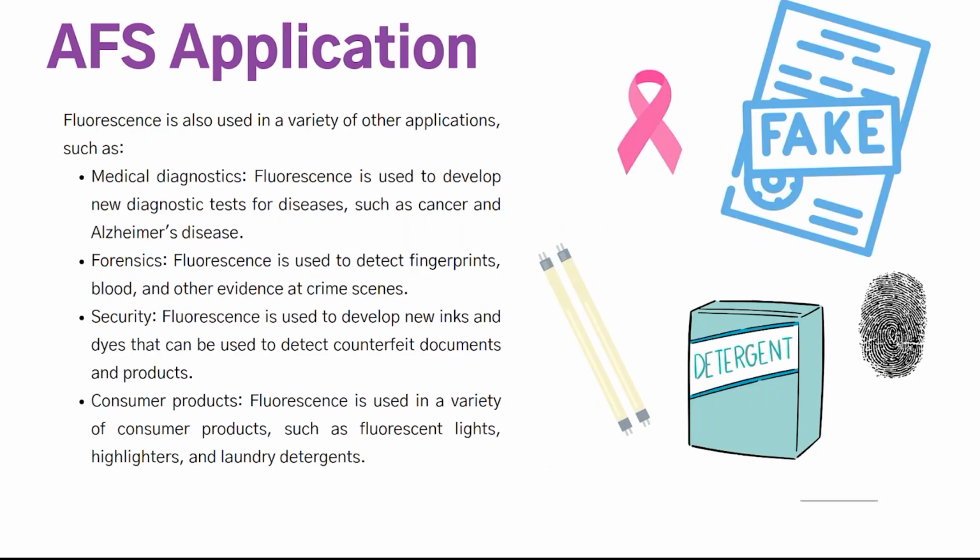Now, on to the application of AFS. This method is used in a variety of applications. One such example is in medical diagnostics, where it is used to develop new diagnostic tests for diseases such as cancer and Alzheimer's. It is also used to detect fingerprints, blood, and other evidence at crime scenes in the forensics field.